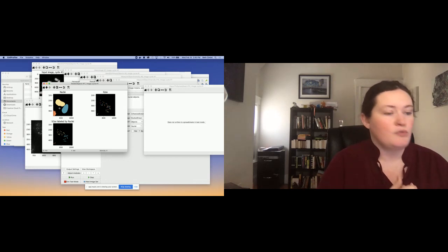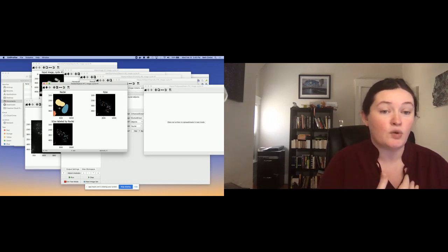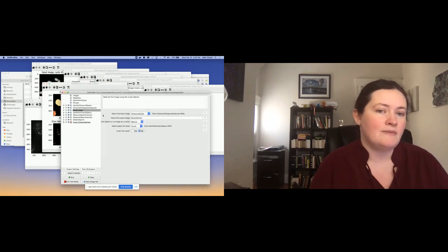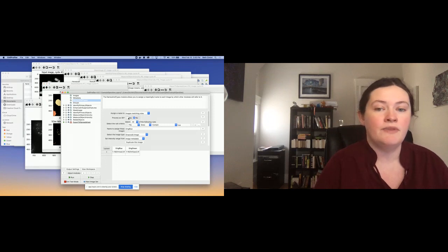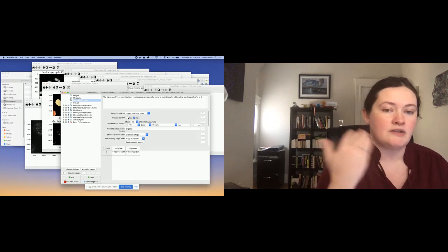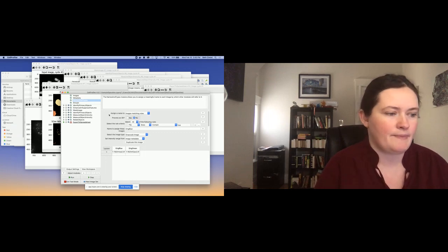Someone asked about 3D volumes. You can look at 3D as an individual series of stacks if you want, but in the names and types module, I can specify that a particular image set is 3D. And then I can look at it as a whole volume at once, not just one Z-plane at a time. Great question.